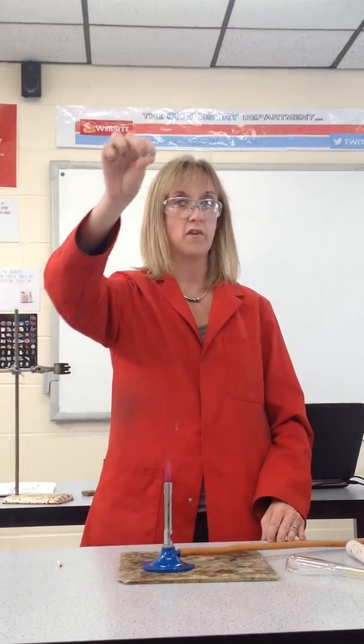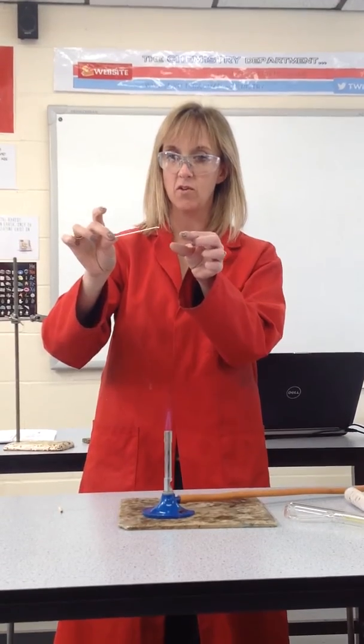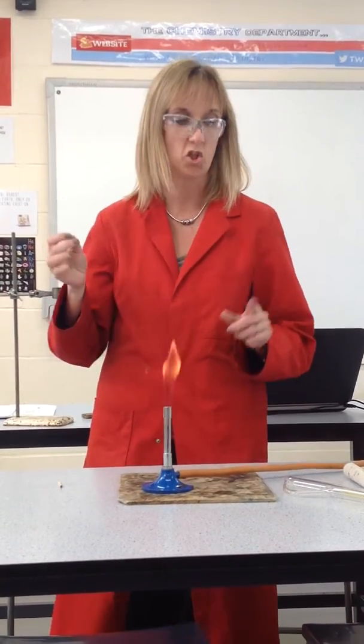You don't need to hold it in there very long — this is already sealed. So it's open at that end, that end is sealed, and it's now ready to be used as a tube.